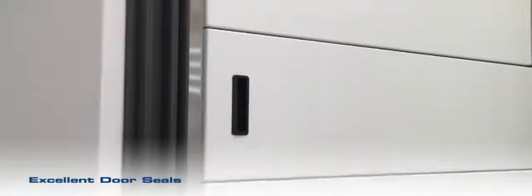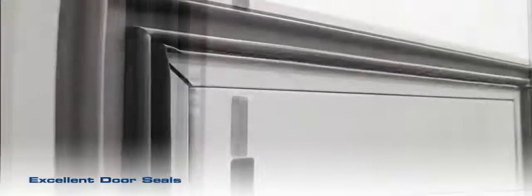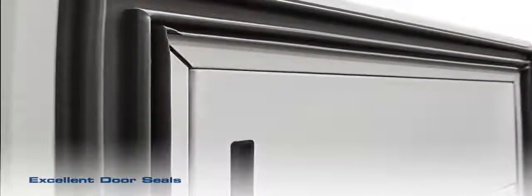Drip-all gasket seals protect against heat loss. Gaskets are heated to prevent frost build-up to facilitate easy door closing.